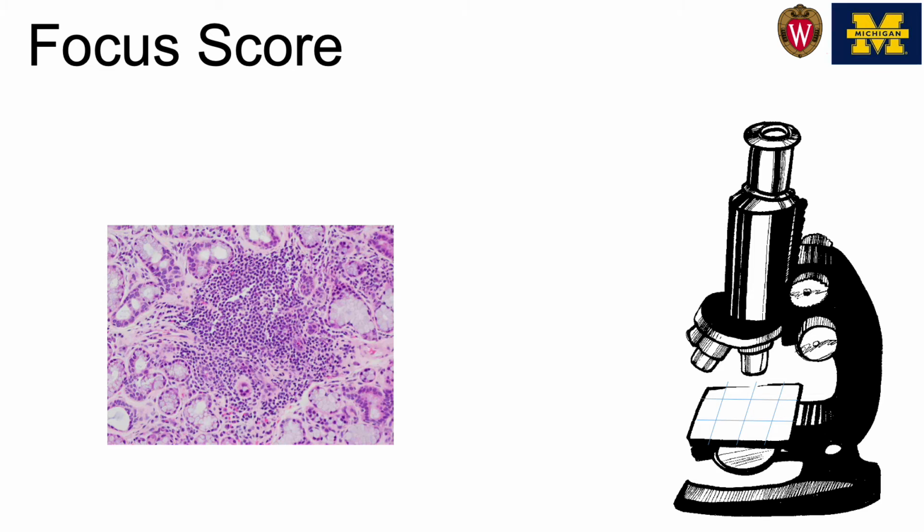Now, personally, having tried to obtain a reticle, it can be very difficult, and I found the most success through reticles.com. Olympus has some reticles available as well. However, I had difficulty with obtaining the correct reticle due to shipping errors.